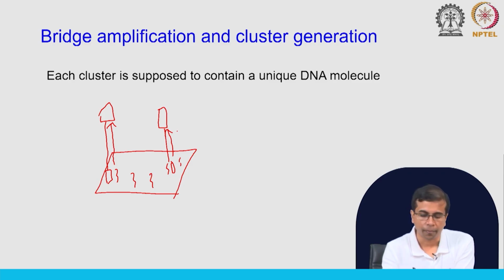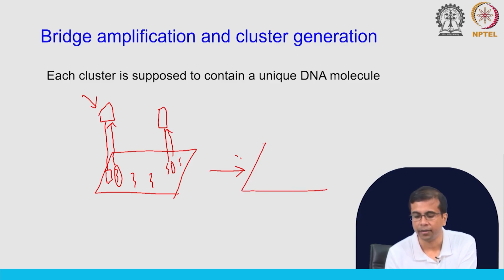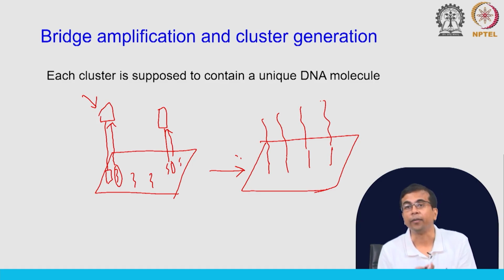So, what will happen is that once this is amplified, these molecules can then be released, right. So, once these fragments are extended starting from this complementary sequence, you can release these DNA fragments. Okay. So, what you have at the end of this process is something like this. We have these DNA fragments, right, that are generated on this plate. And again we can imagine you have millions of them on this plate. Now, again you need to calibrate the number of DNA molecules that you will allow to hybridize on this plate, because in the next step there is this bridge amplification.